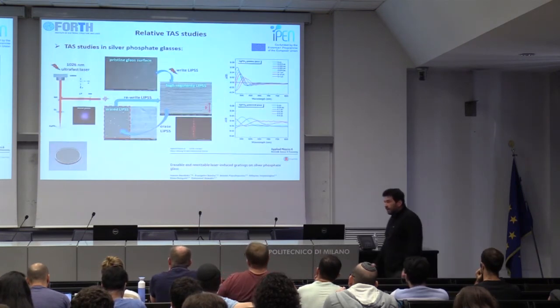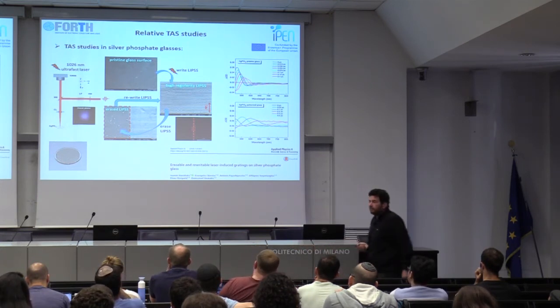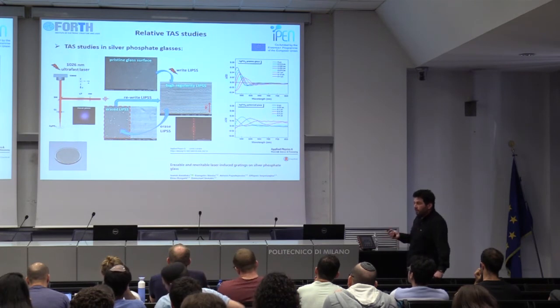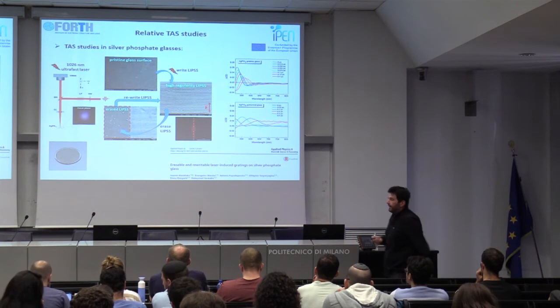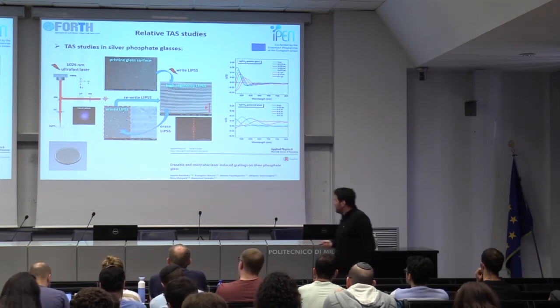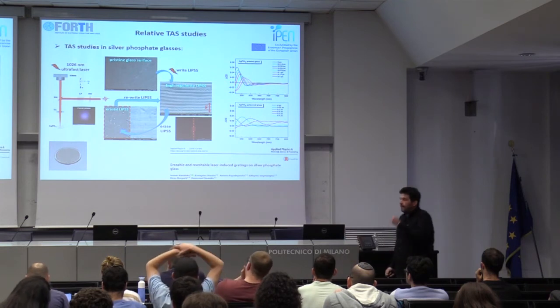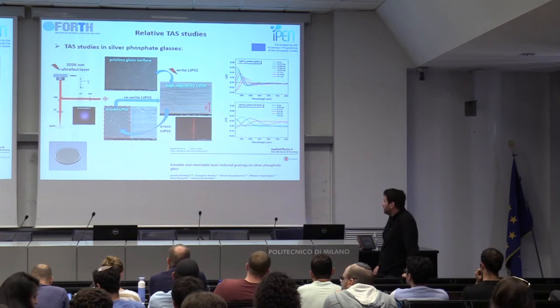And it can also be done in glasses, when we examine how the silver plasmonic features within the glasses that we make and we treat evolve with time. So we believe that TAS is also a good diagnostic tool in other types of applications.